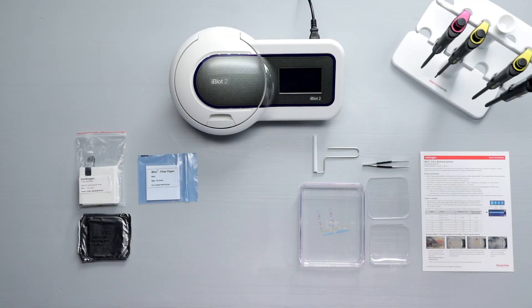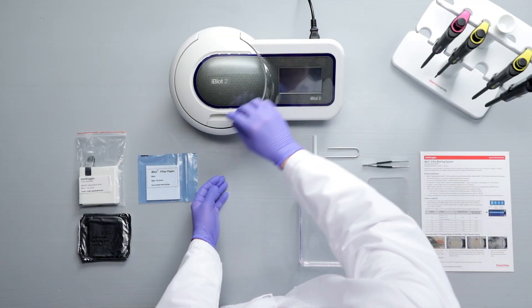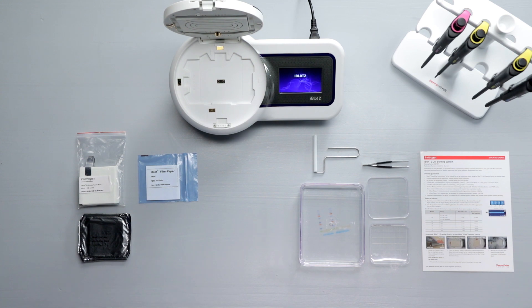To get started, turn on the iBlot2 Dry Transfer Device and open the lid. The digital display will show icons for the available actions.